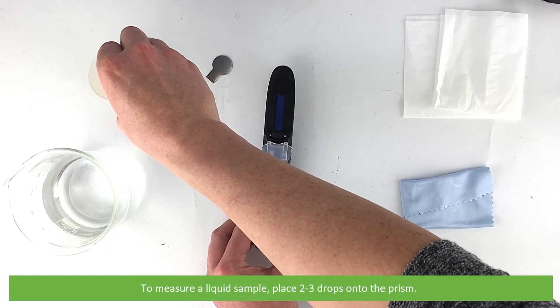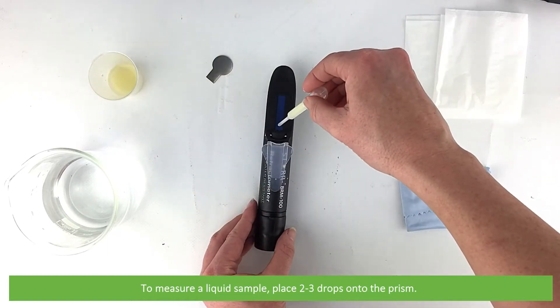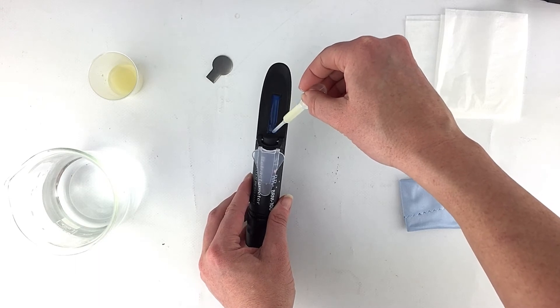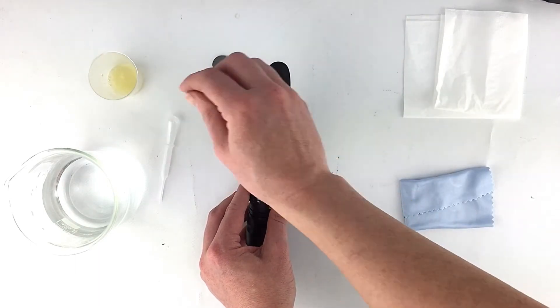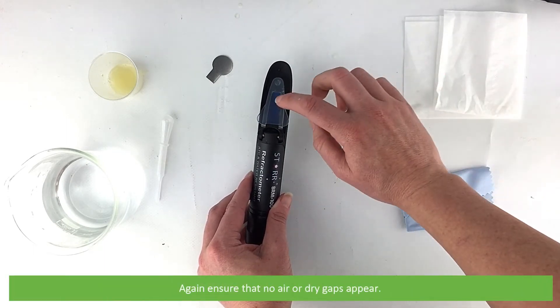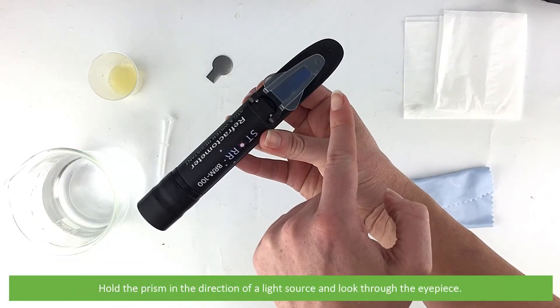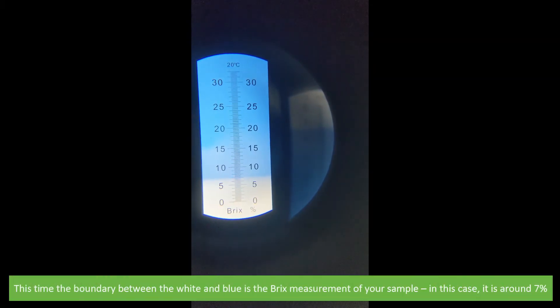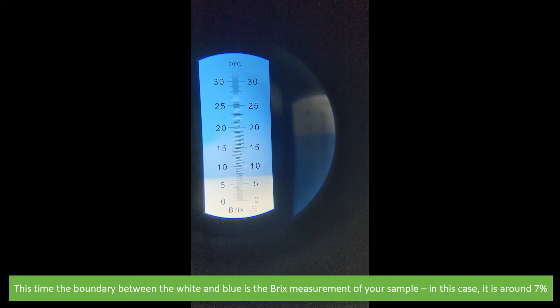To measure a liquid sample, place two to three drops onto the prism, close the cover plate, and again ensure that no air or dry gaps appear. Hold the prism in the direction of a light source then look through the eyepiece. The boundary between the white and blue is the Brix measurement of your sample — in this case it's around seven percent.